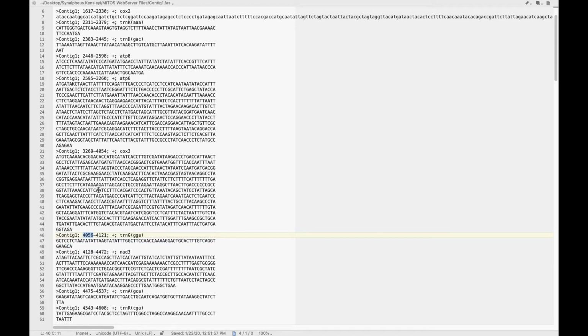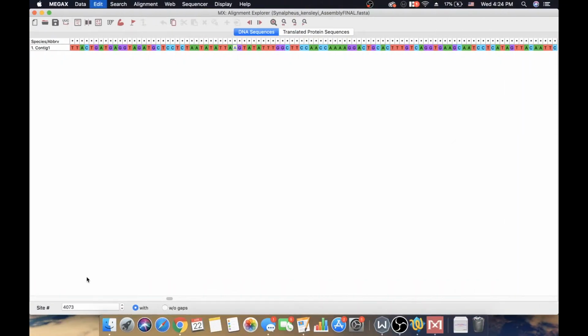So we know that the end of COX3 shouldn't be too far into this gene. Typically, you're looking for an end as close to 4056 as possible, but sometimes the stop codons can be as far as 40 nucleotides into this sequence. Since we're only roughly 20 nucleotides through, we're going to keep going.